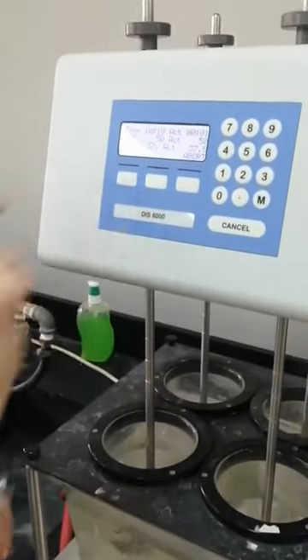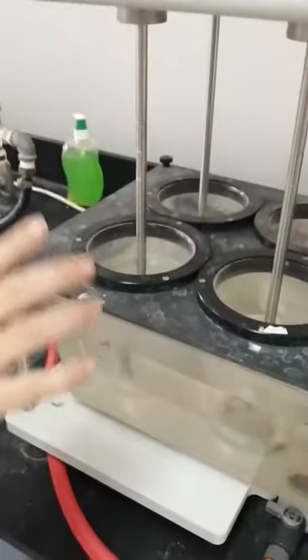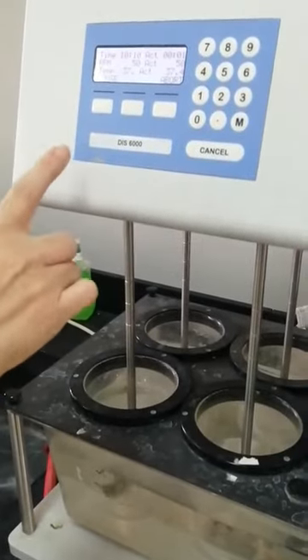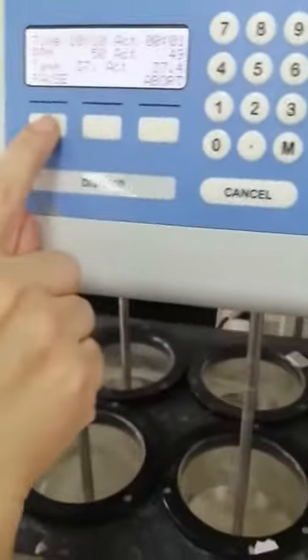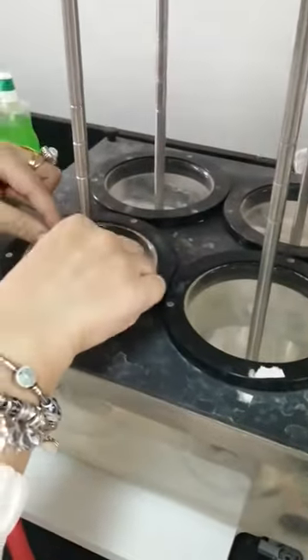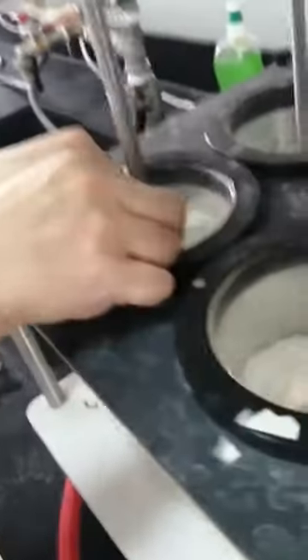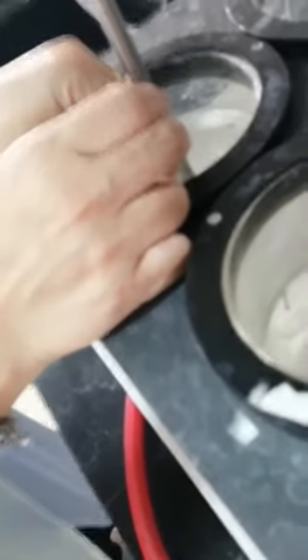Five minutes is finished. So after the 5 minutes, I will withdraw my sample from the midpoint, as we said before, not the bottom, not the top. I withdraw 5 ml using the syringe.